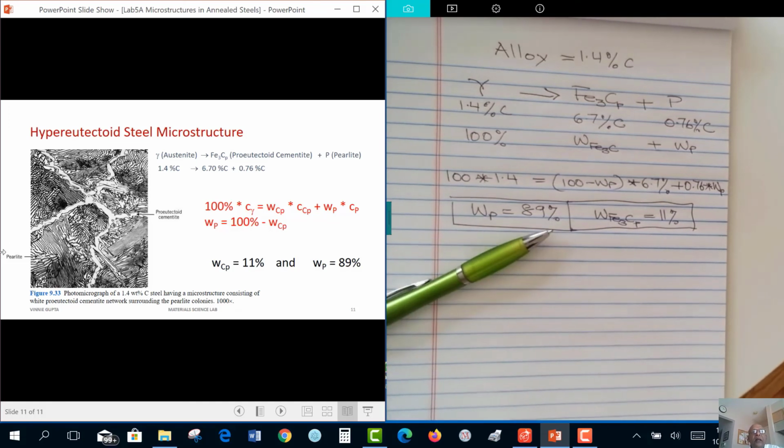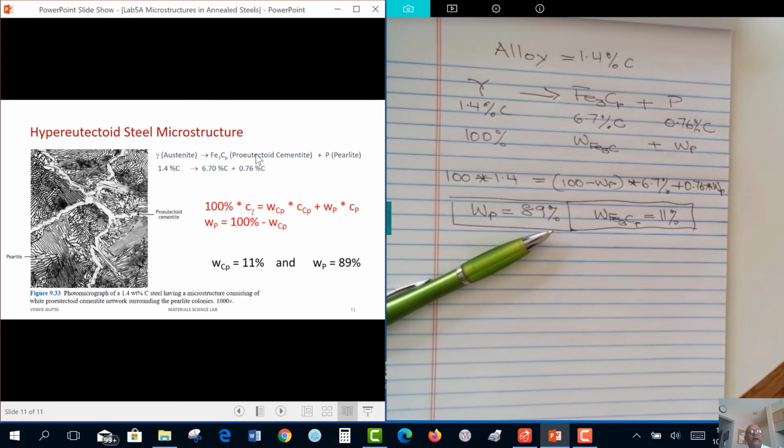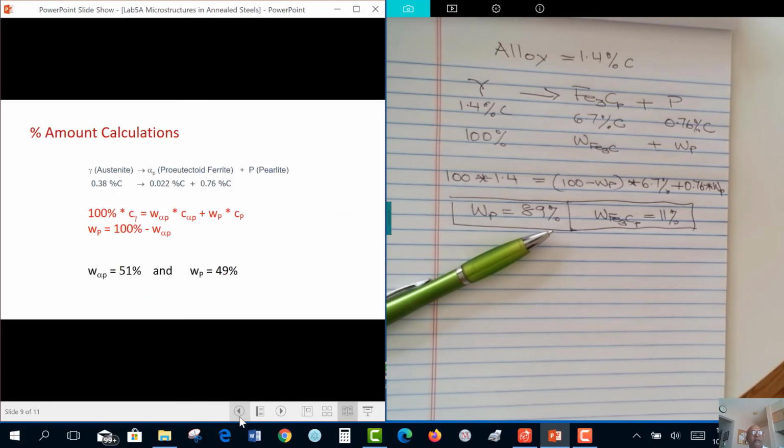Okay. Remember that if it is a tiny amount, then we will see them as these little bubbles. This is what we are going to see in the second part. So there you have it. These are all called annealed steels because we are cooling them very, very slowly. So again, as a summary, what happens?